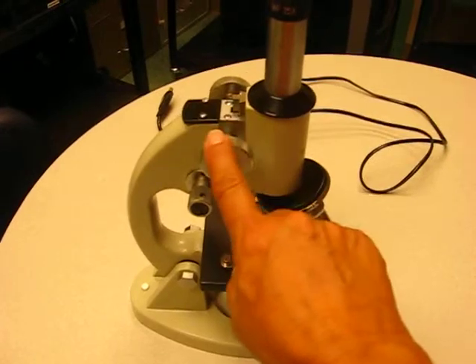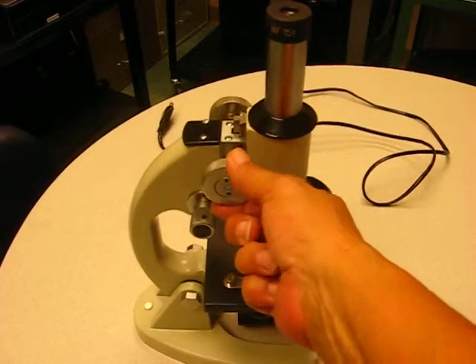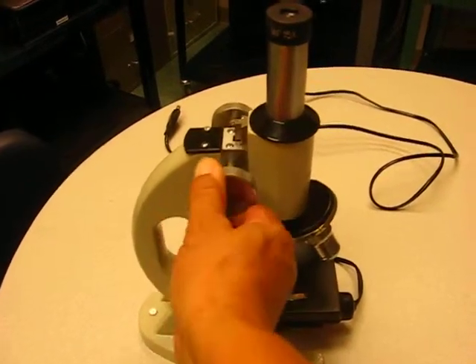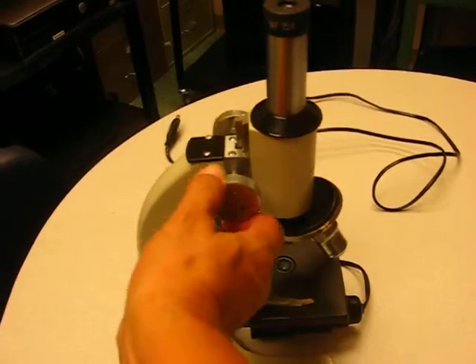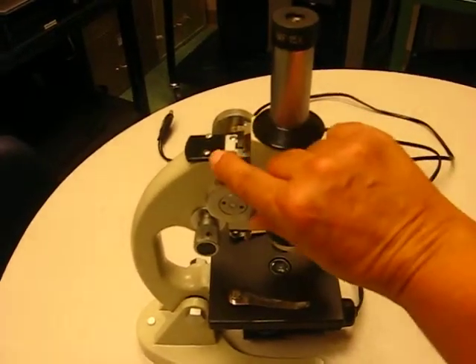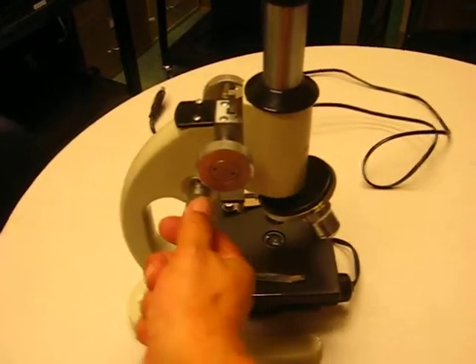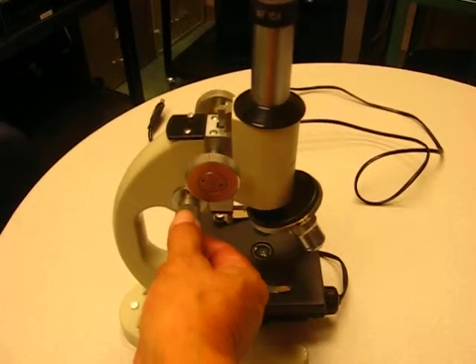The next thing you have is your coarse adjustment knob, and this is what you use to make your first adjustments. You always adjust up, away from the slide — you start in the lowest position and always go up. Once you get the specimen into view, you will use the fine focus knob to bring the resolution in and make it clear.